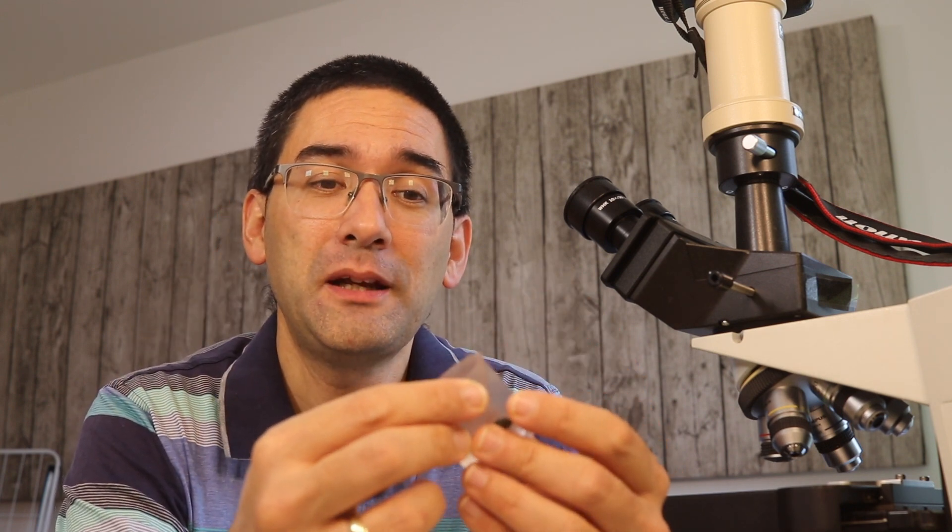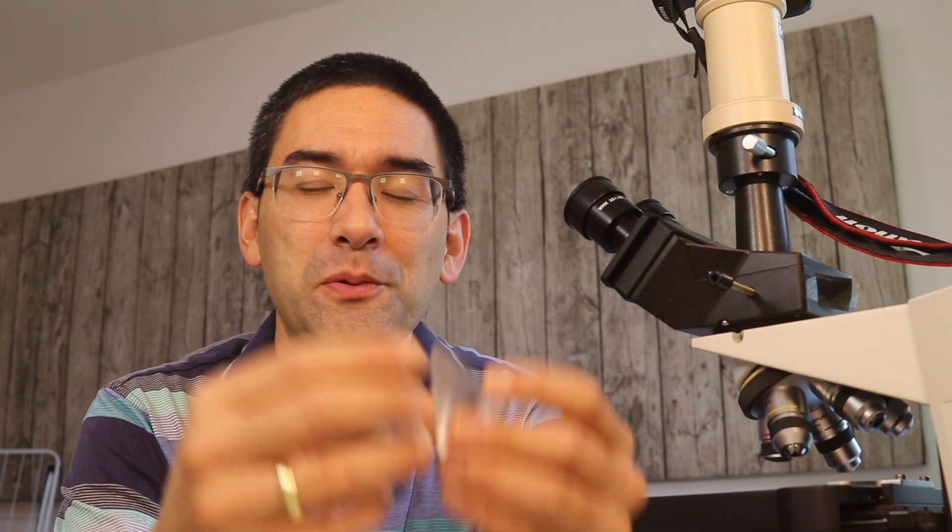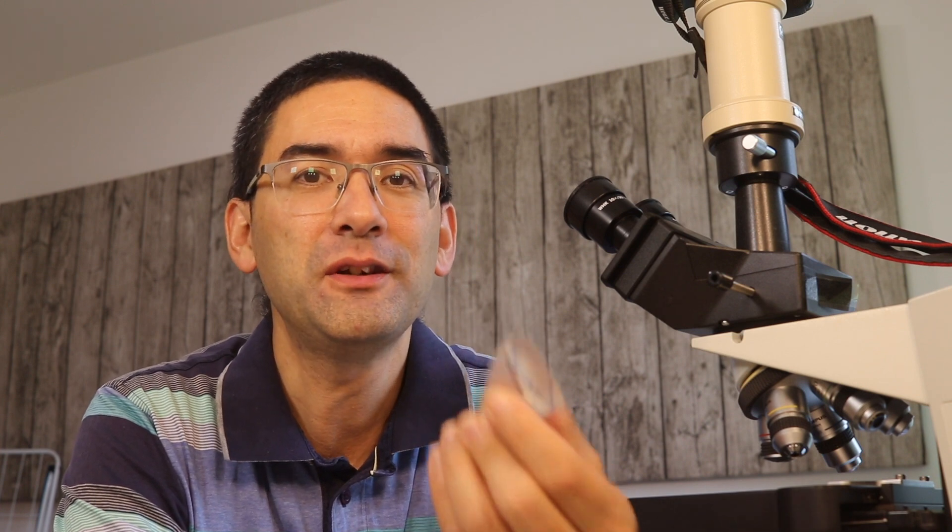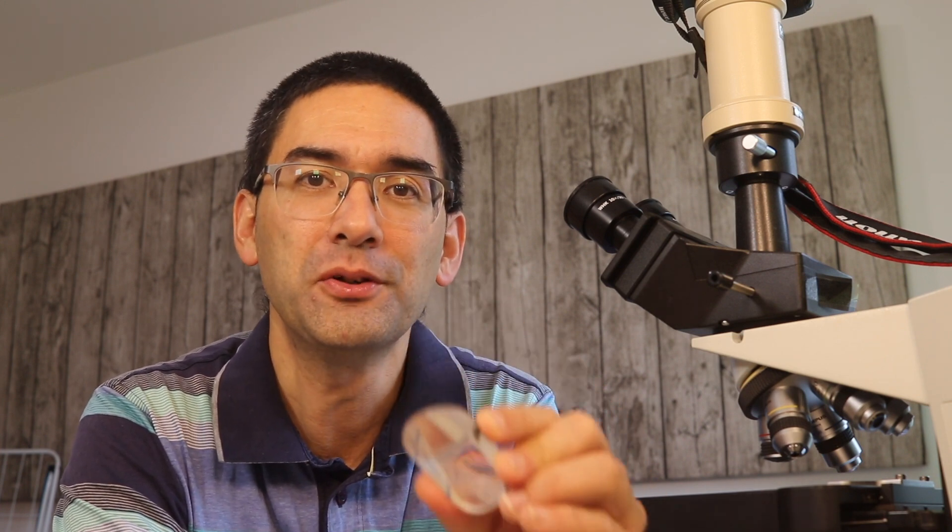And you can see that the arrow is upside down. And if I want to get a right set up image, then I have to either use a second lens system, this was the first attempt in stereomicroscopy to turn it around again is to use inverting lenses again or to use possibly mirrors and or to use prisms. But ever since they have invented stereomicroscopes, they've been using prisms because they have a whole range of significant advantages over mirrors and also over lens systems.